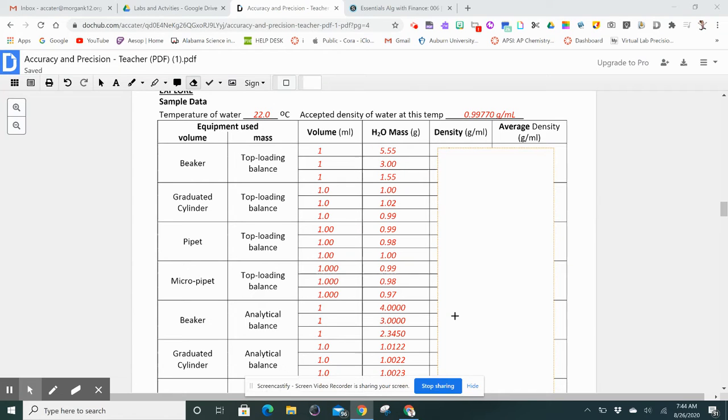All right, good morning. We are looking at sample data for the Accuracy and Precision Lab. For my remote students, I made a video showing the students actually performing the lab, but it did not give you any data numbers. It shows you how to use the instruments and what we had to do, but it didn't give you any data to help complete the lab. So that's what this quick video is about.